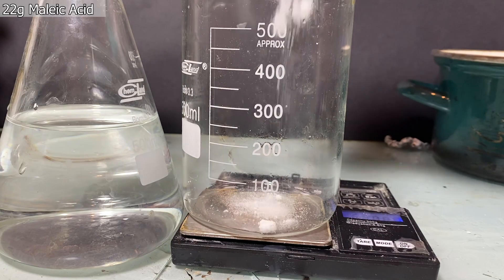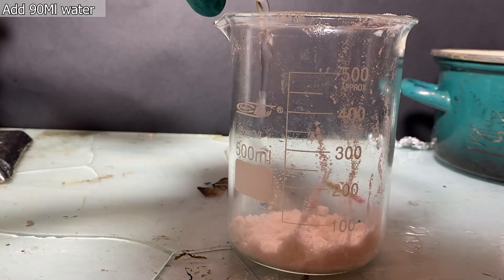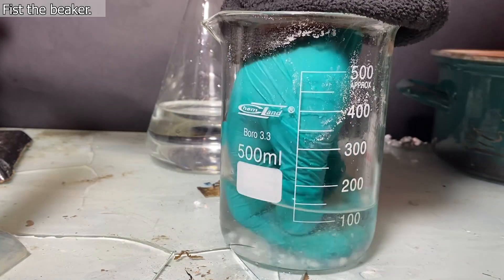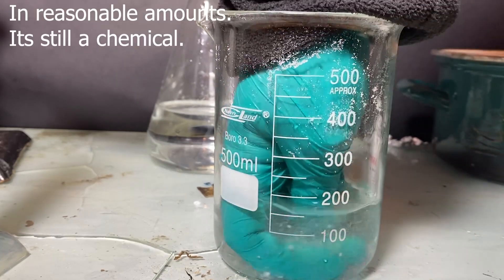I've added around 22 grams of maleic acid into a beaker. Maleic acid isn't toxic, so it's kinda okay to play around with.